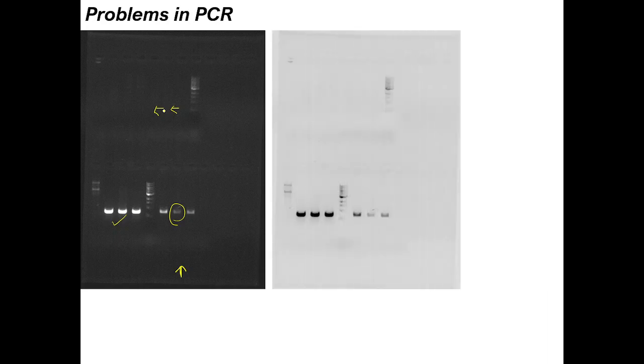I inverted this picture, and you can always do that by inverting the picture, and maybe in another lecture I can tell you how. Essentially what I did was adjust the image contrast and invert this image in Paint 3D software. You can use other software as well. The ultimate bottom line we are trying to discuss is what happens if you are not getting any kind of yield in your PCR.